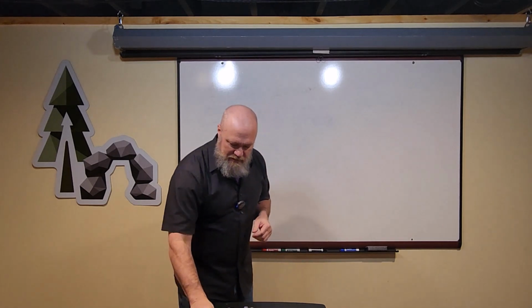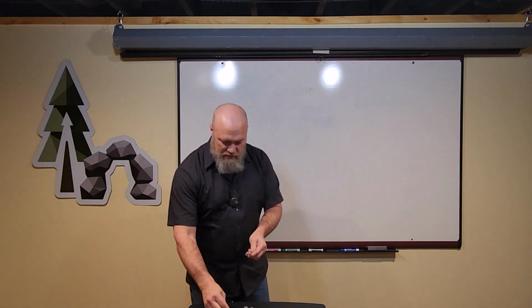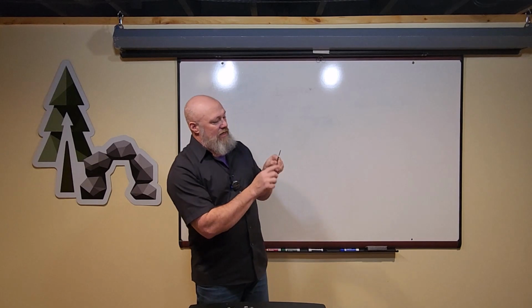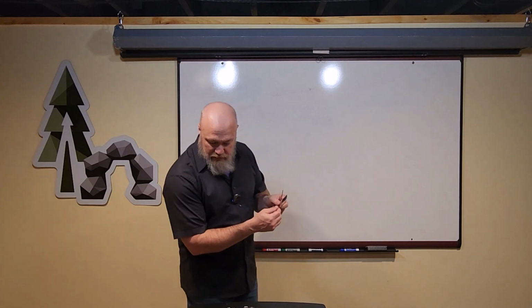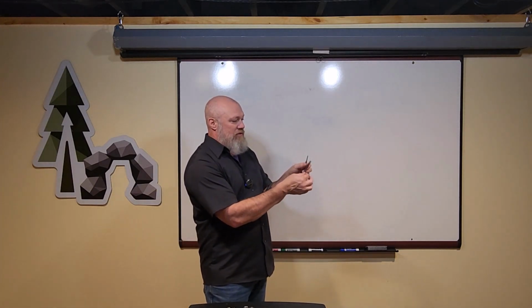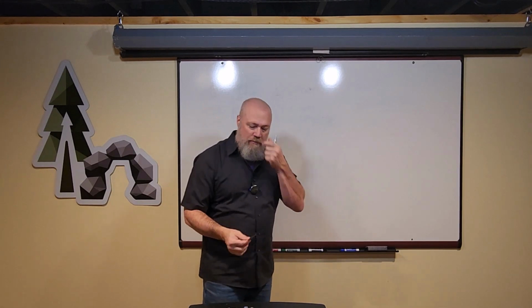And then the other instrument that everyone seems to love, for whatever reason, in sharp dissection is your scalpel. Your scalpel is going to come with the scalpel handle. There's nothing dangerous about this at all. It's got a little grooved head on it where you will match up a number 22 or 20 scalpel blade. So you're going to open this little tin foil and it's going to go right down on that. It clicks into place, and then you can use the scalpel.